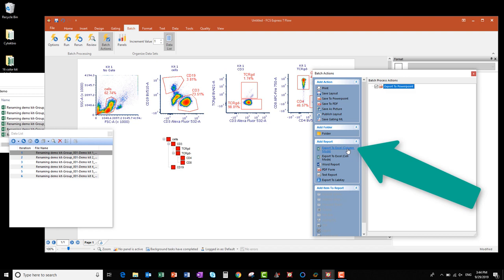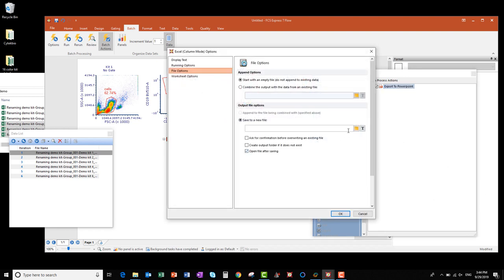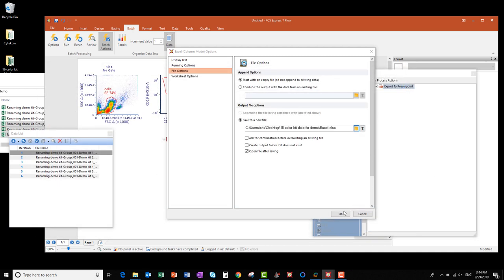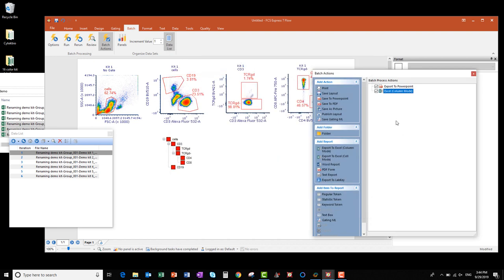Next, I want to click Export to Excel Column Mode. Again, click the folder icon under Save to New File, set your directory, and enter your file name. I'll type this one as Excel. Click Save, click OK, and now you can see that action has been added to the list too.